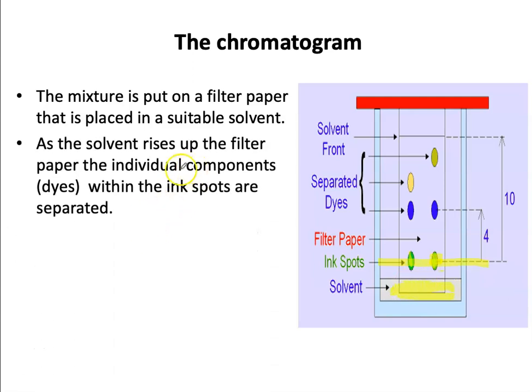As the solvent rises up the filter paper, the individual components start to separate. So we can see here, this substance is a mixture of two inks, and this one is also a mixture of two inks. So none of these two substances are pure.